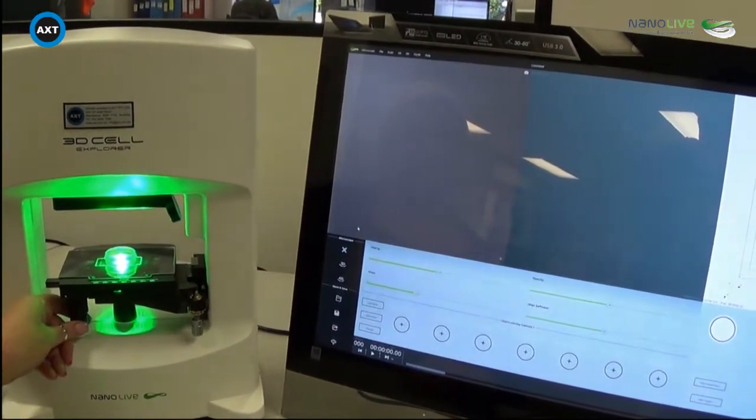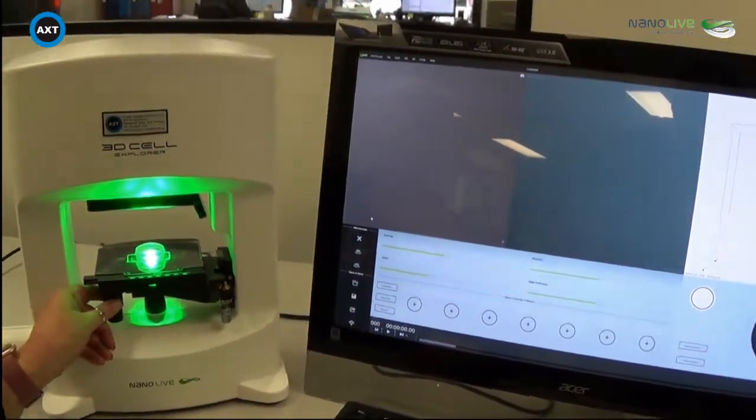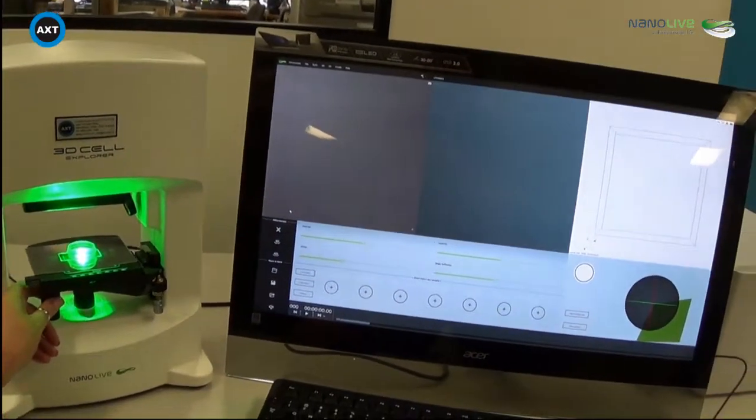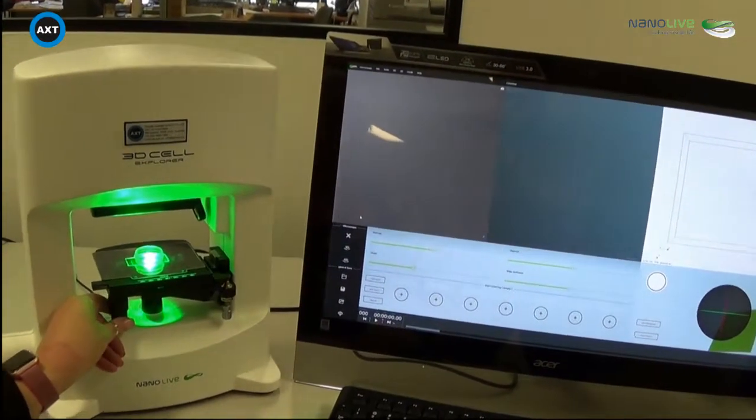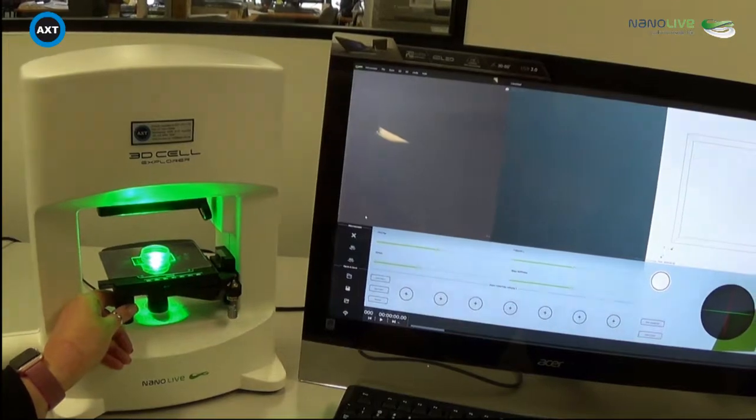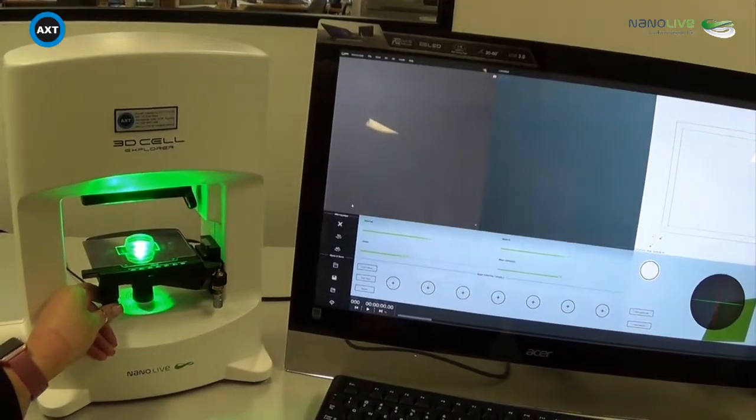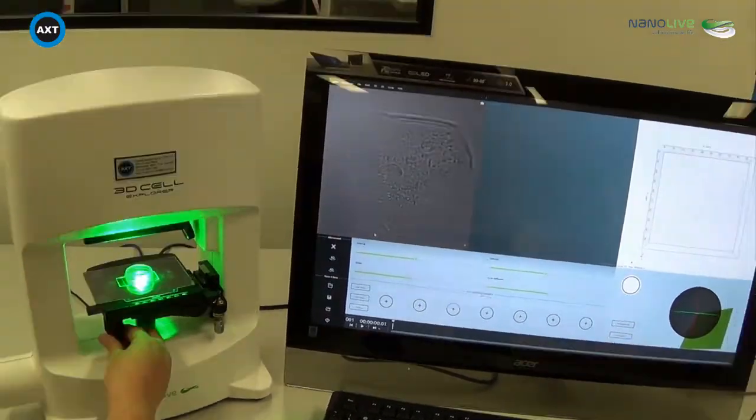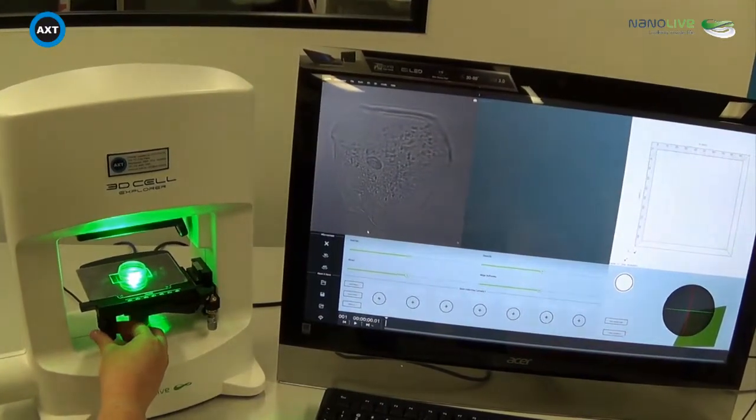I'm just going to use the XY control on the microscope stage to find our cells. The cells we're looking at today are cheek cells from inside the mouth. So we just did a very simple epithelial scrape and added the cells to just some water in the micro dish. Okay, so here's a cheek cell that we found in the dish.